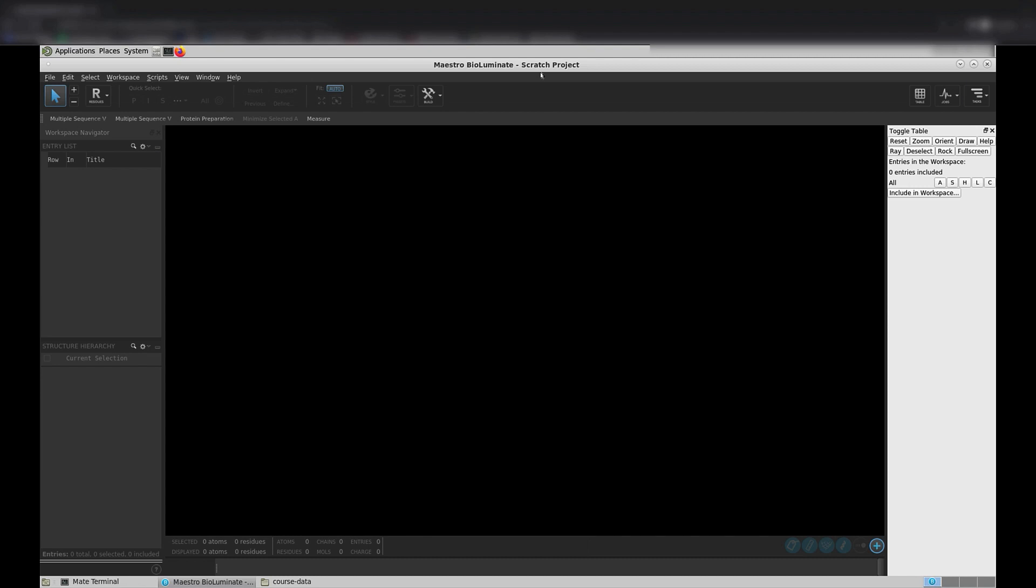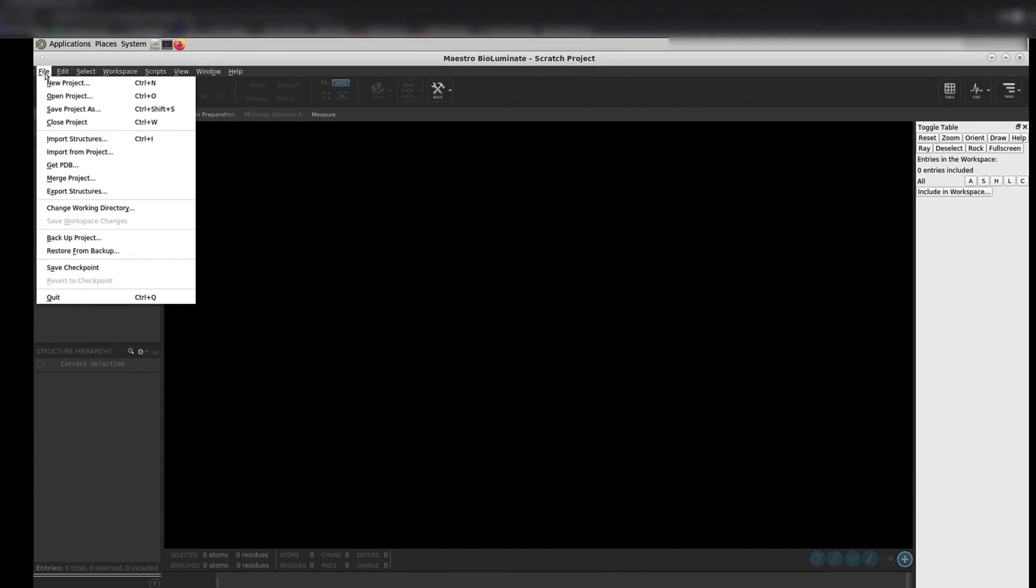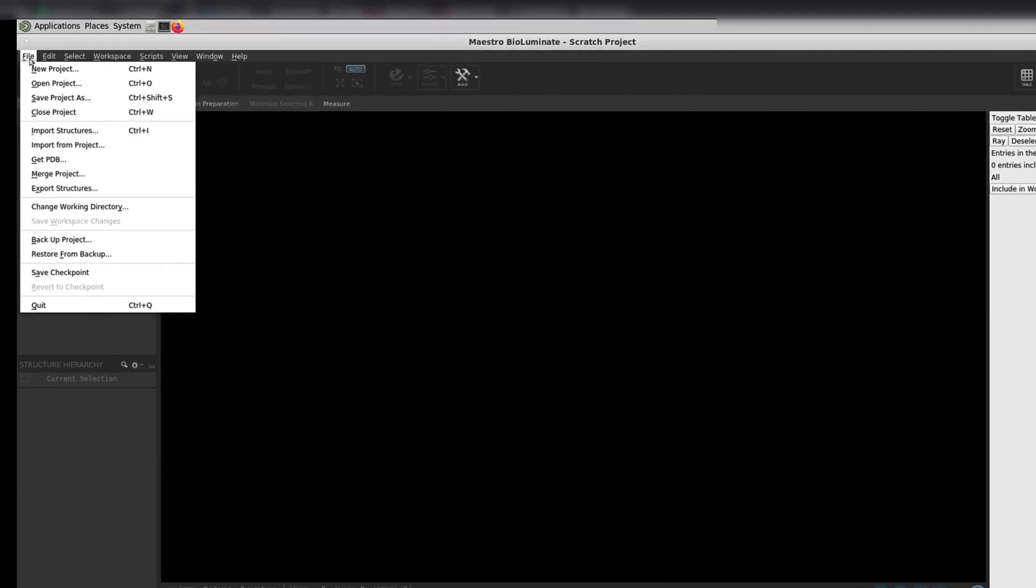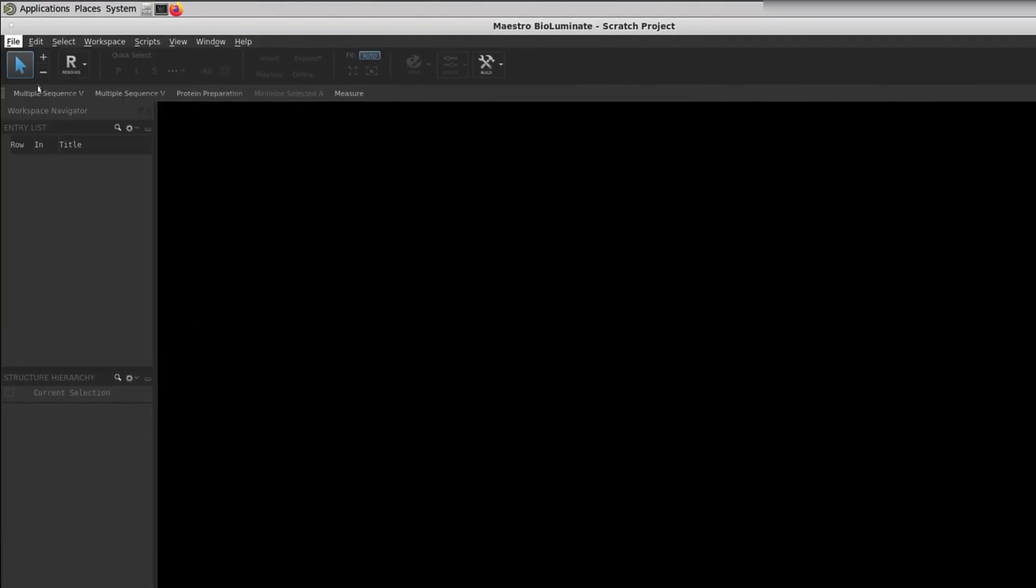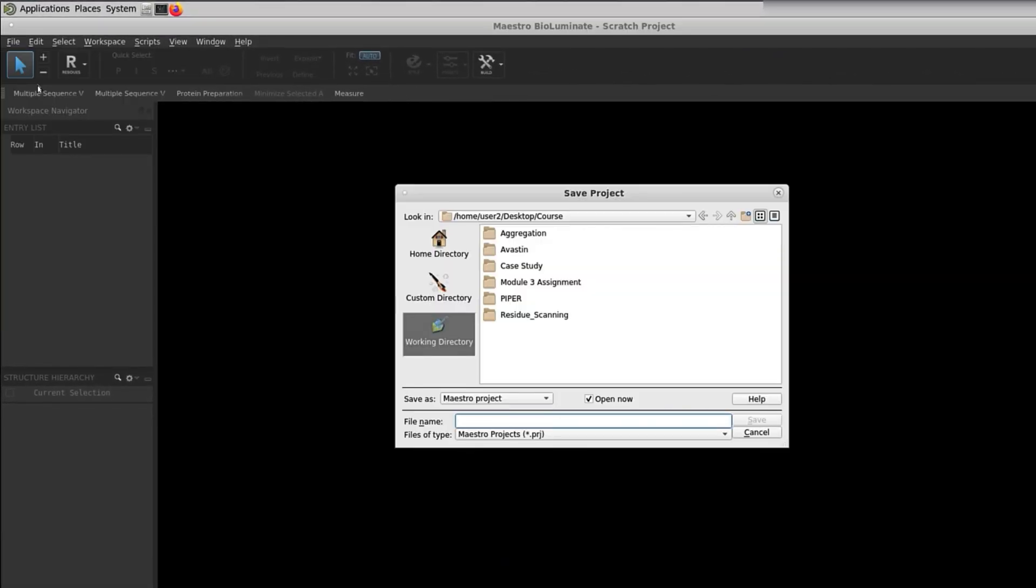To save your BioLuminate session as a project, come up to File, and choose Save Project As. We will save the project as BioLuminate underscore intro, and click Save.